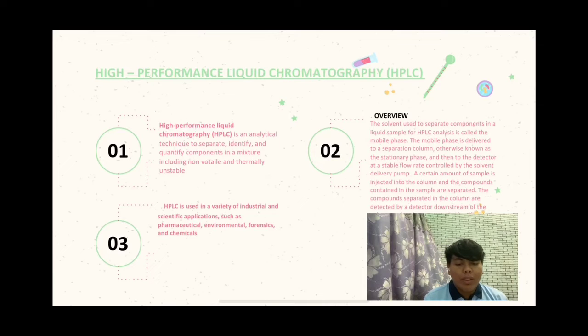Hi, back with me again. So for now, I will give some introduction to HPLC, or High-Performance Liquid Chromatography.